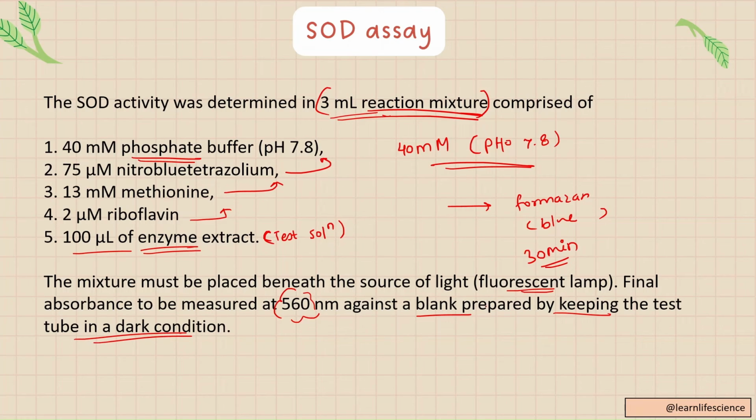On the other hand, you are going to prepare your blank solution, which will consist of all the solutions except your test solution. There is no need to add your test solution to this blank tube. Only these substrates will be present, and keep it in dark condition so that there is no blue colored formation.